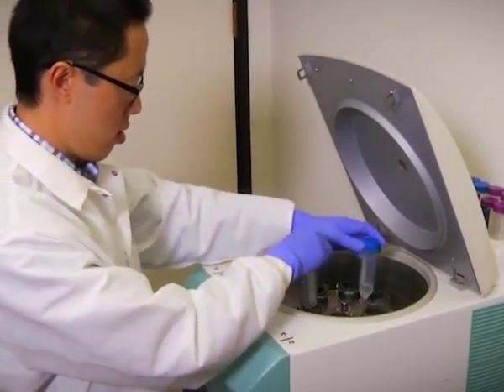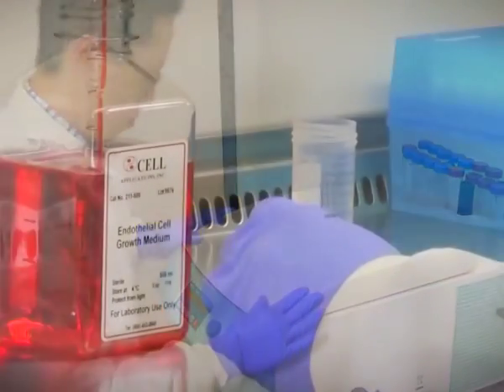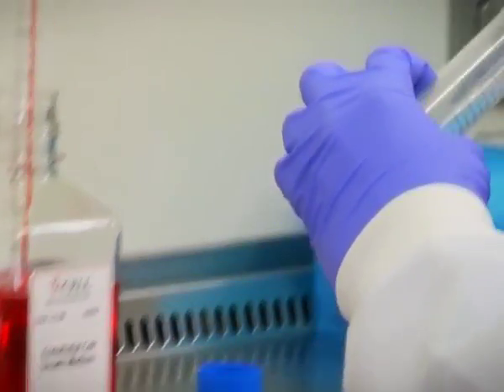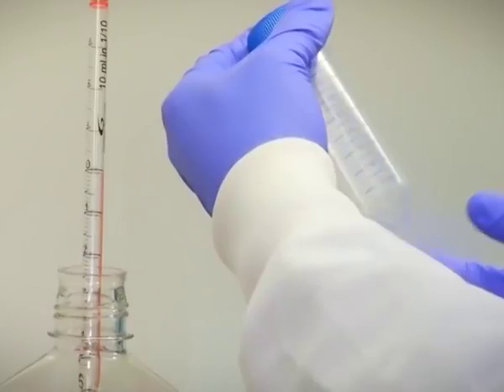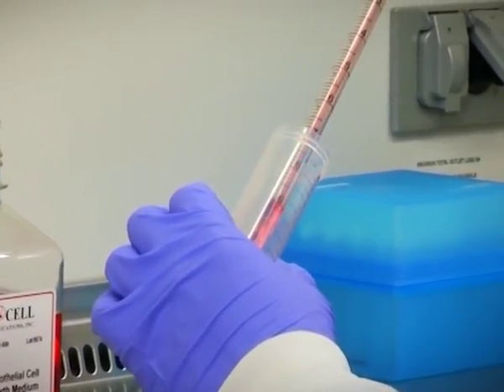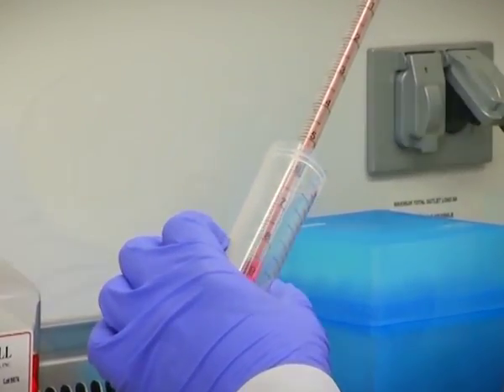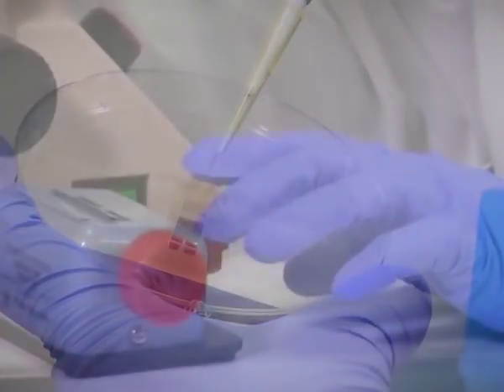For example, mannitol salt agar is selective for staphylococci because most other bacteria cannot grow in its high salt environment. Another selective medium is brilliant green agar, a medium that inhibits the gram-positive bacteria while permitting gram-negative organisms such as Salmonella species to grow.